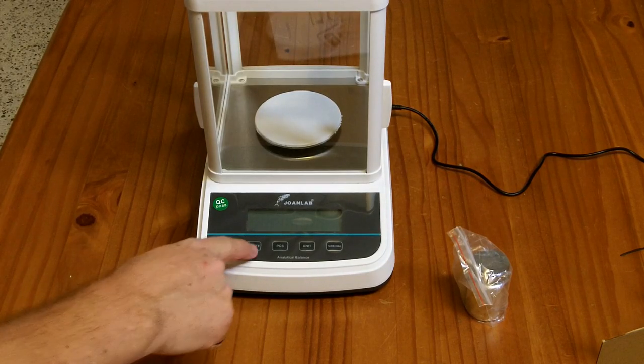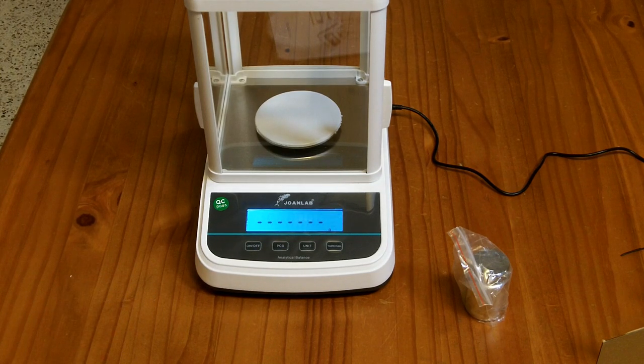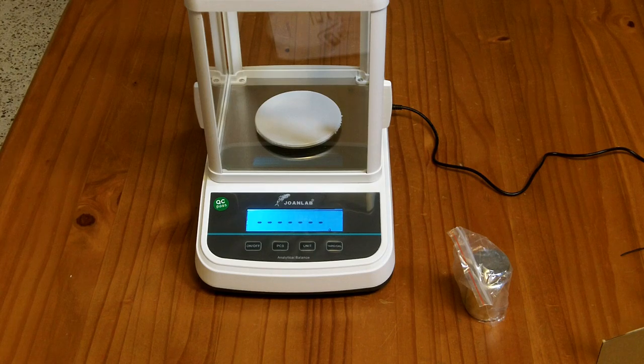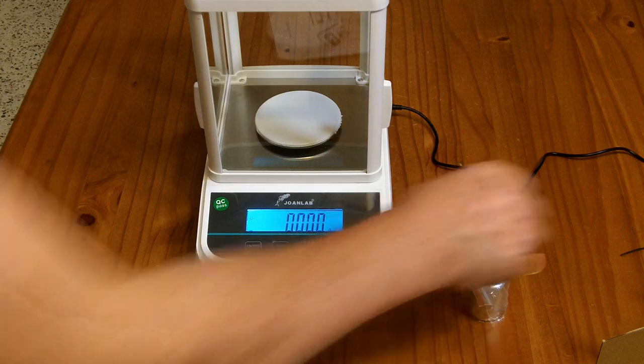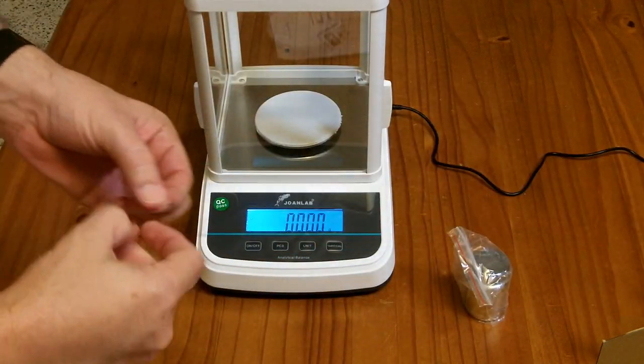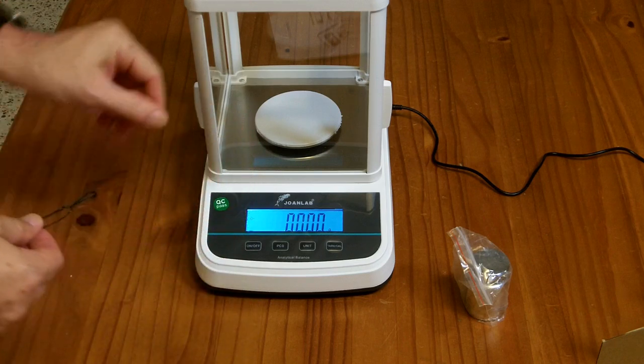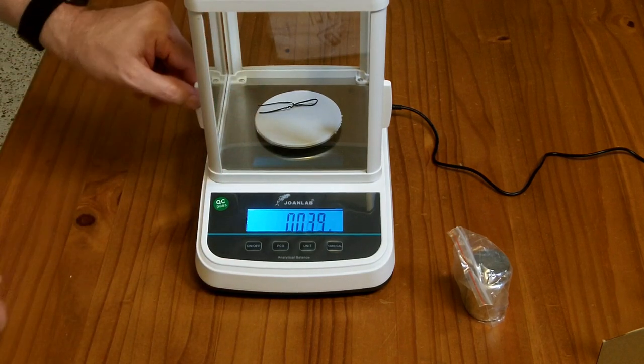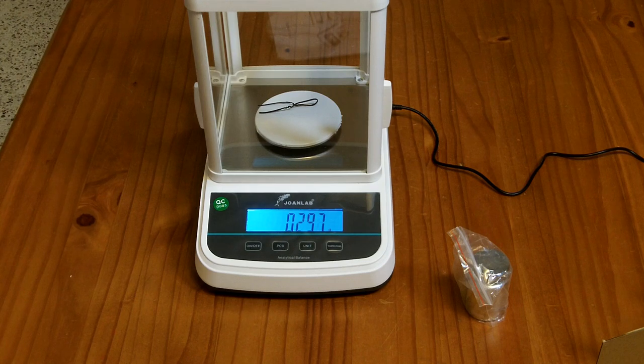Alright, so I've plugged it in, turned it on. It's a whole bunch of dashes and then it went to a whole bunch of zeros. So we're going to put this little twisty tie that was holding the power cord together on it. And according to this scale that is .296 grams. So basically a third of a gram or a little under a third of a gram.